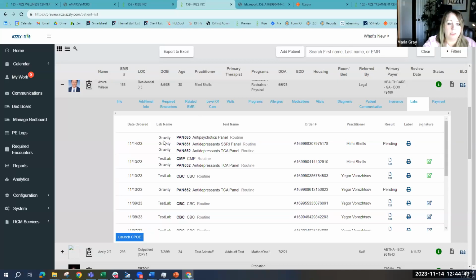Okay, so Debra, do you have any additional comments to add to this? I believe you've thoroughly covered everything. Yes, you've done a good job, Maria, of thoroughly covering everything.